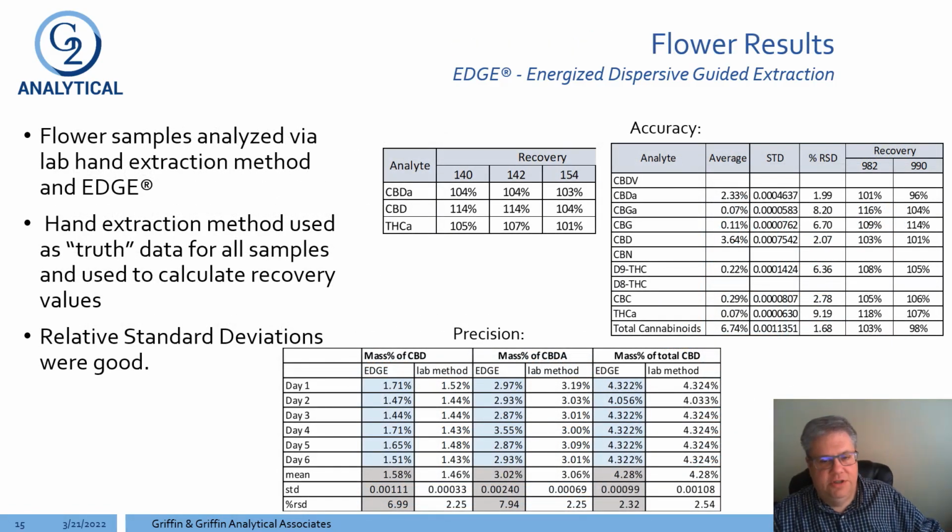So the first project we started was just looking at results from flowers. Could we say that the Edge was reproducing the results that we were getting from our hand extraction? And that's what this crazy data set here goes into detail with. So let me walk you through it real quick. This is actually the work of one of the interns from Wingate University who worked with us for a summer on this project, and they did a really nice job.